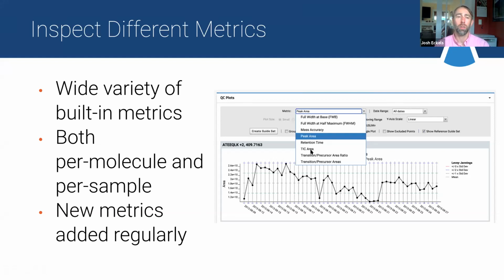That can help us reduce some of the variability on a single molecule and give a quick at-a-glance view of the full sample and full signal that we're getting. And we're continuing to add new metrics based on feedback from users. We'd love to hear things that you're using and that have been helpful, and figure out how we can make them general and roll them out more widely.